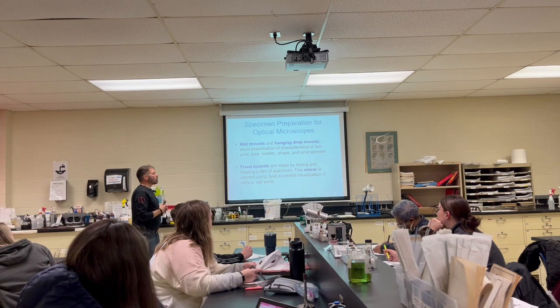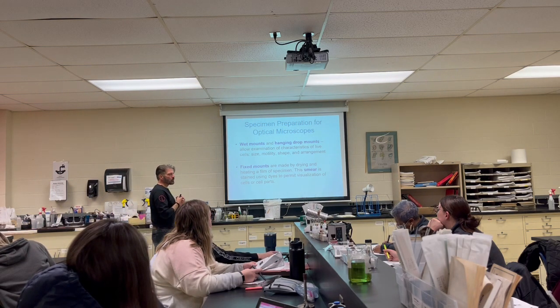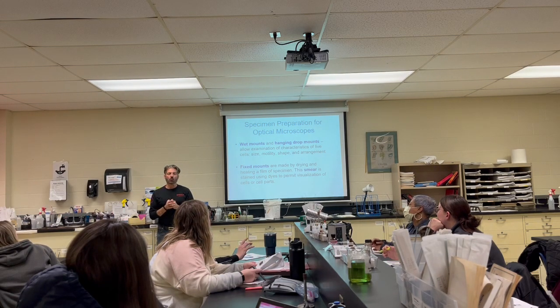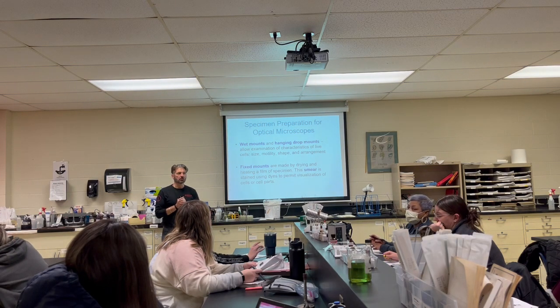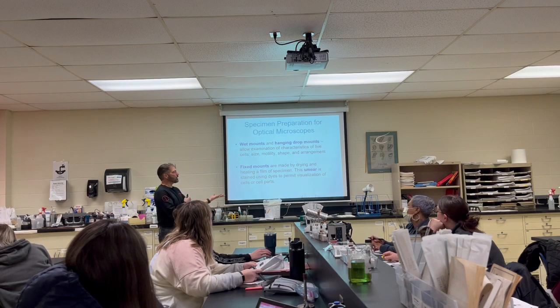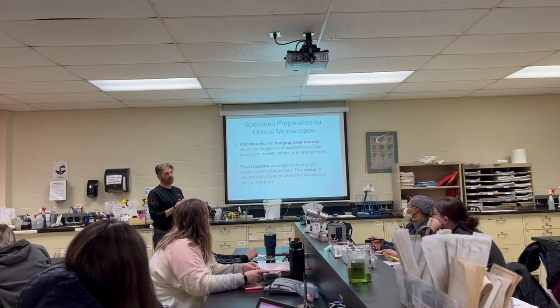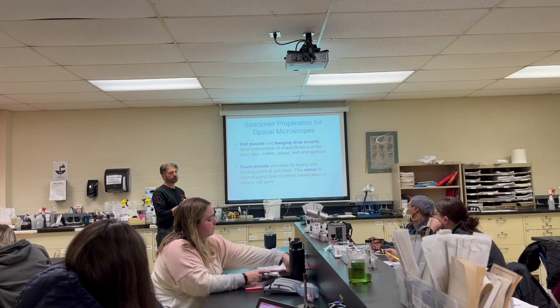We're going to be doing a lot of fixed mounts. Did everyone bring in a plate today? If you forgot, I'll give you another one. Did anyone have something not grow, or have nothing on there? It doesn't matter. We'll take whatever you brought in, put it on slides, heat fix it, stain it, and take a look at it.